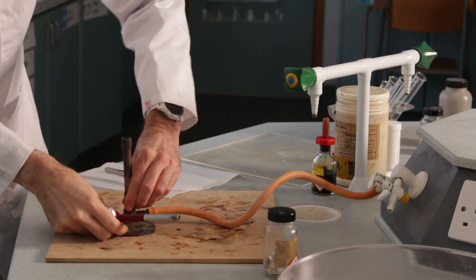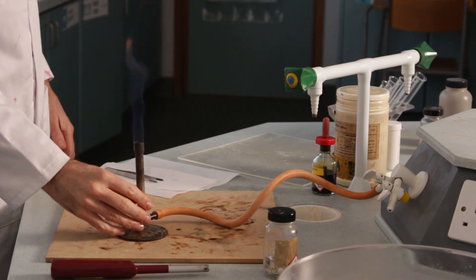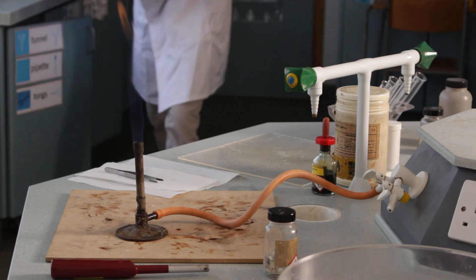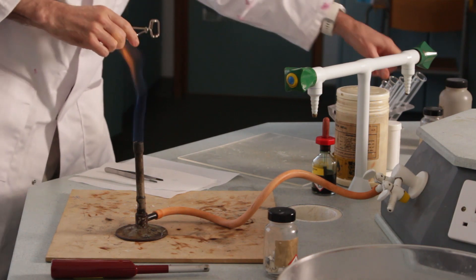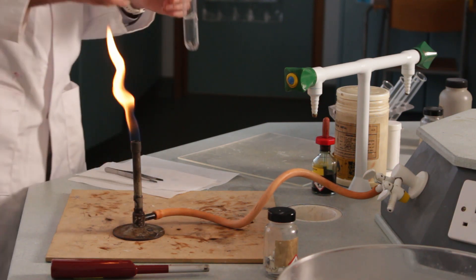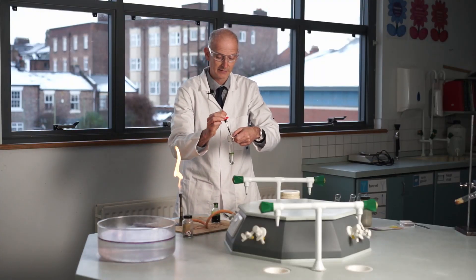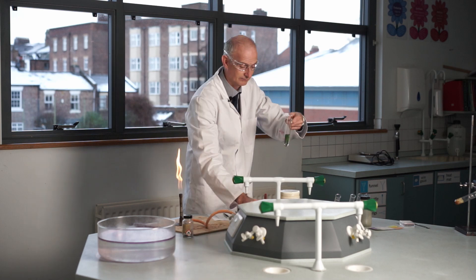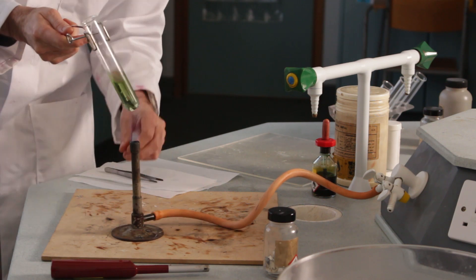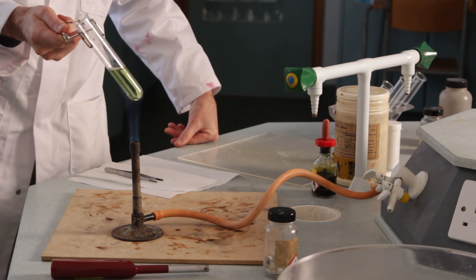So just light up a Bunsen burner. I'm going to put some indicator in this first to see if there's any sign of anything happening — it's green. We can see if we can change that by giving it a bit of a blast. Okay, so at room temperature water there's no reaction.